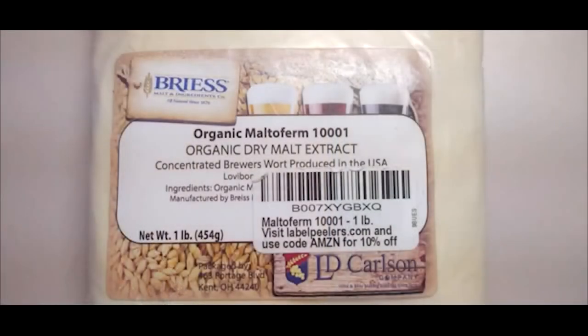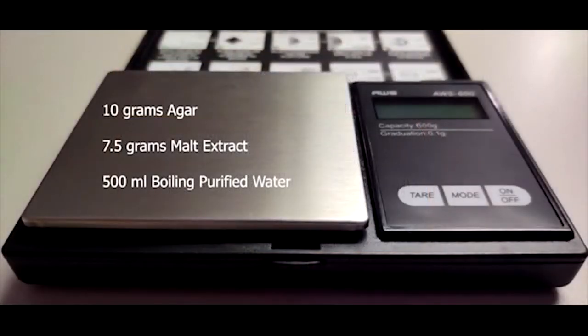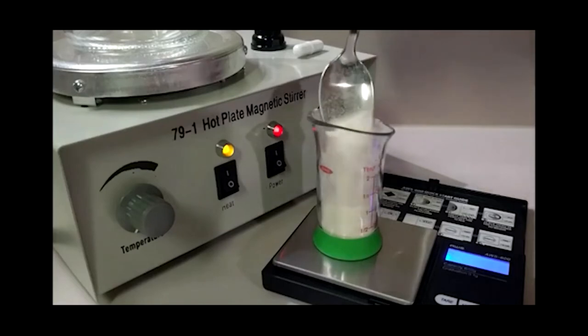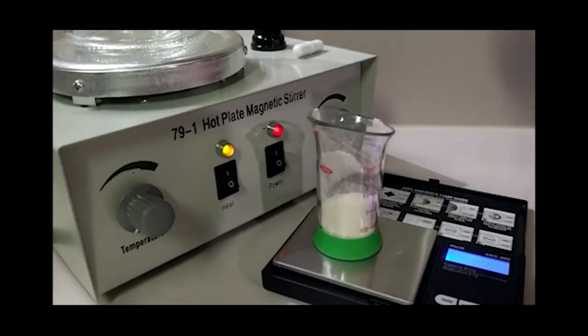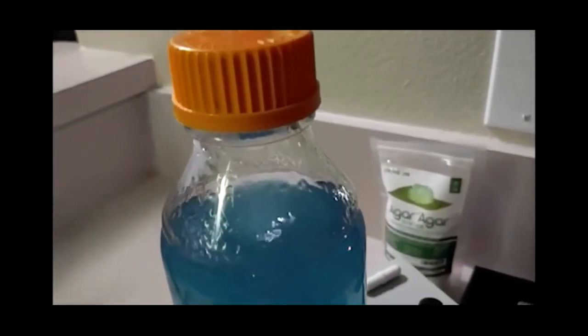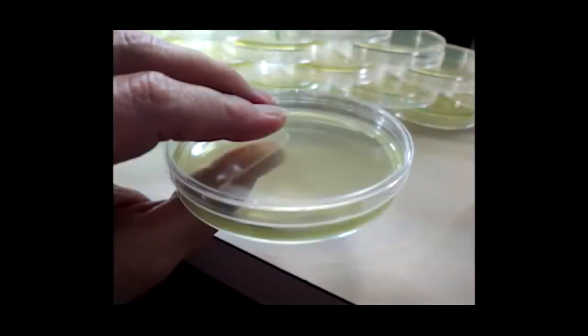We have since come up with a standard MEA recipe that works to promote the onset of rhizomorphic growth while reducing the chance of contamination by using a 10 gram agar, 7.5 gram malt extract to 500 milliliters of purified water. Through much research, we found that adjusting levels of nutrients really changed the growth to a more rhizomorphic pattern. When we dialed back the malt extract a little, the mycelium seemed to stretch out, searching for nutrients while containing and or eliminating any contamination. When cloning or working with spores, we have found water agar to be the best recipe to start with. We then transfer to MEA plates, then a final transfer to MYA gives us the rhizomorphic growth we desire.